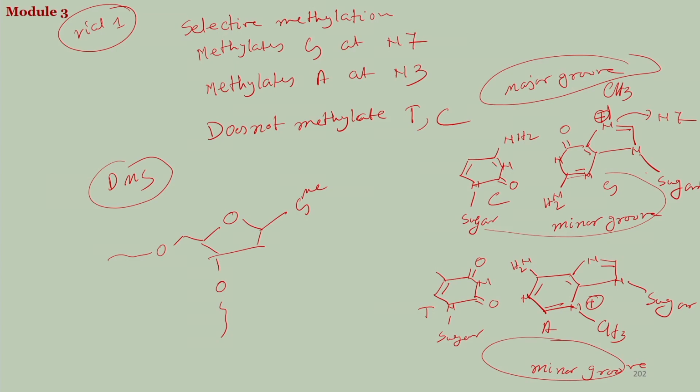Adenine will remain intact, because the methylation happens in the minor groove.